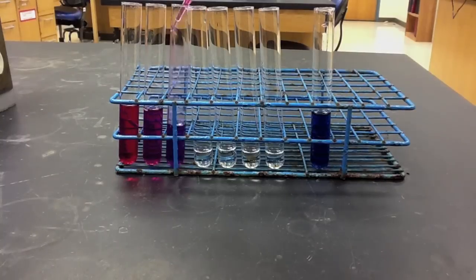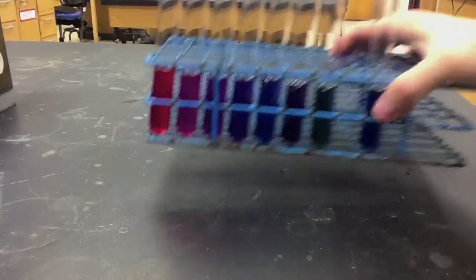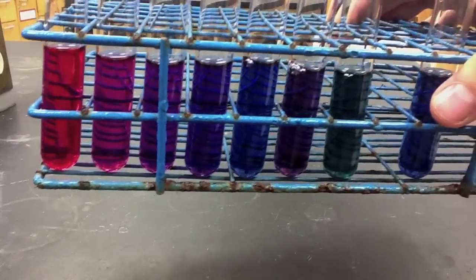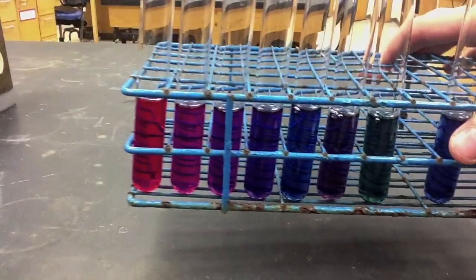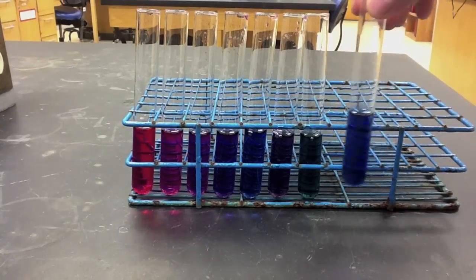As I add the anthocyanins to the buffers, I can begin to develop my colorimetric scale. And this colorimetric scale, where I have colors that correspond to each pH, will then allow me to determine the pH of my unknown solution.